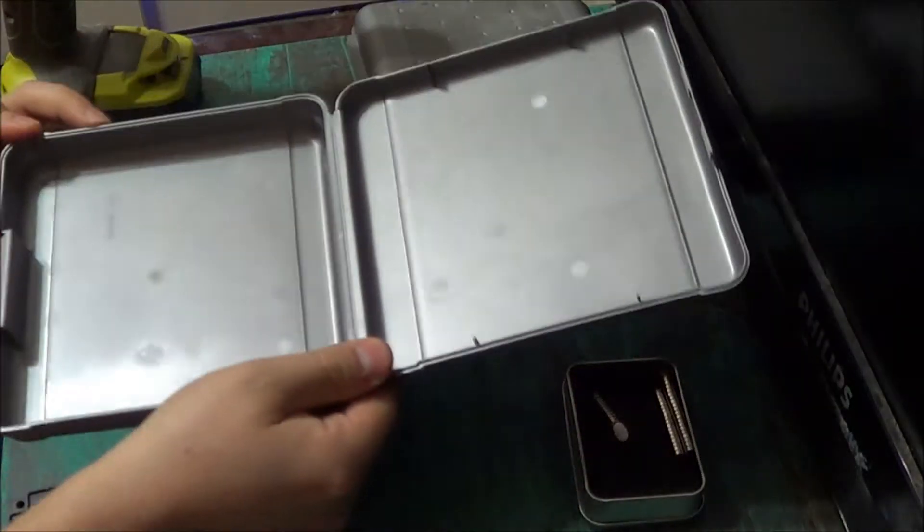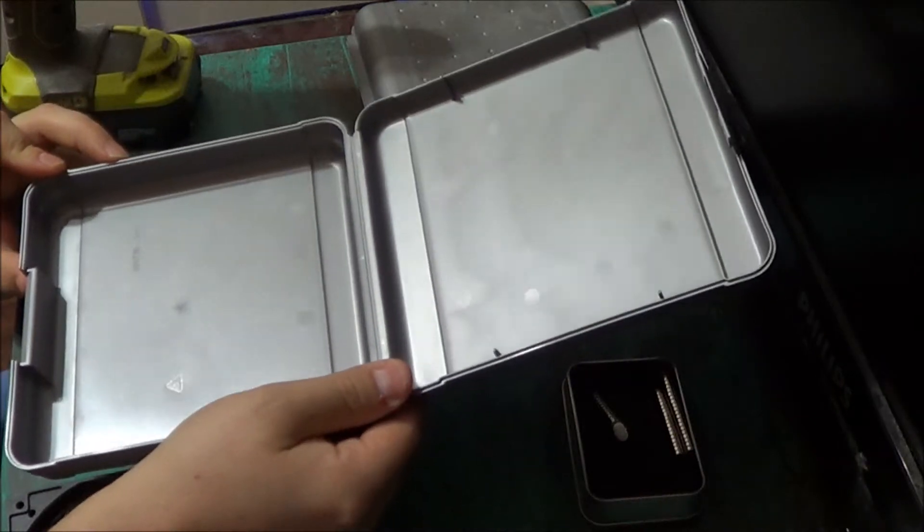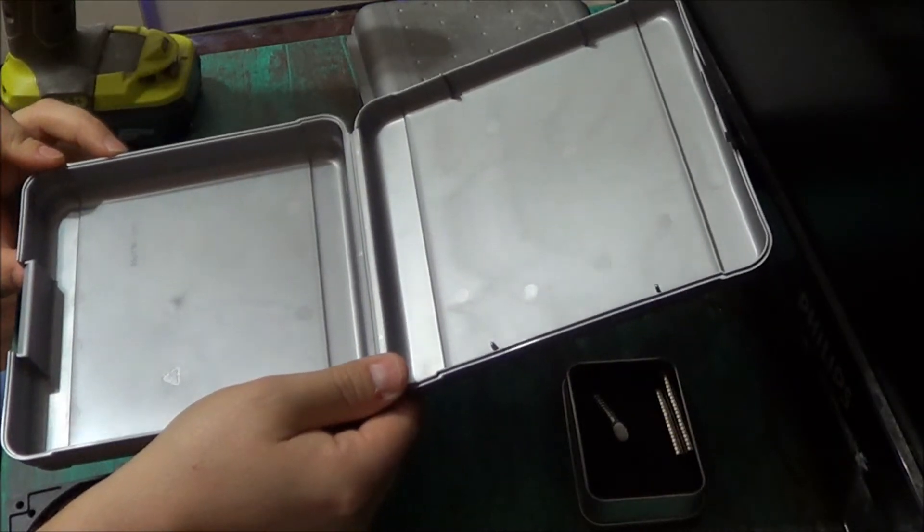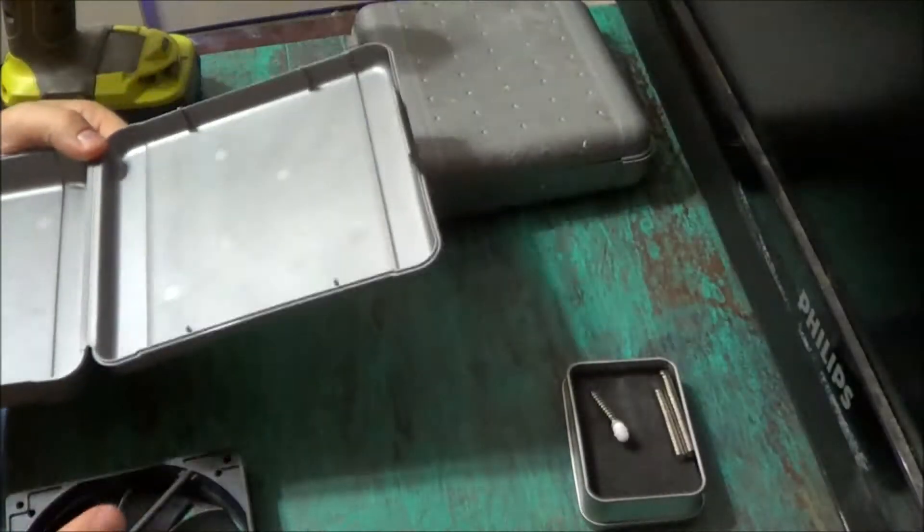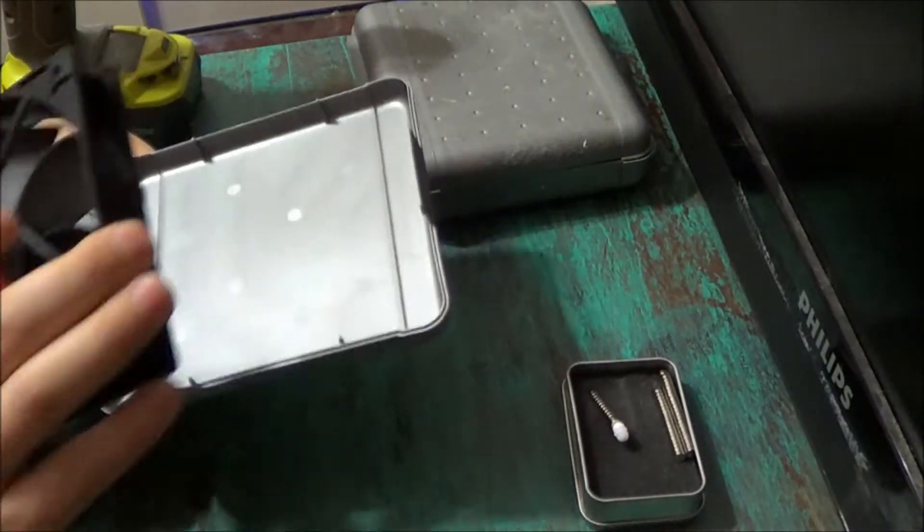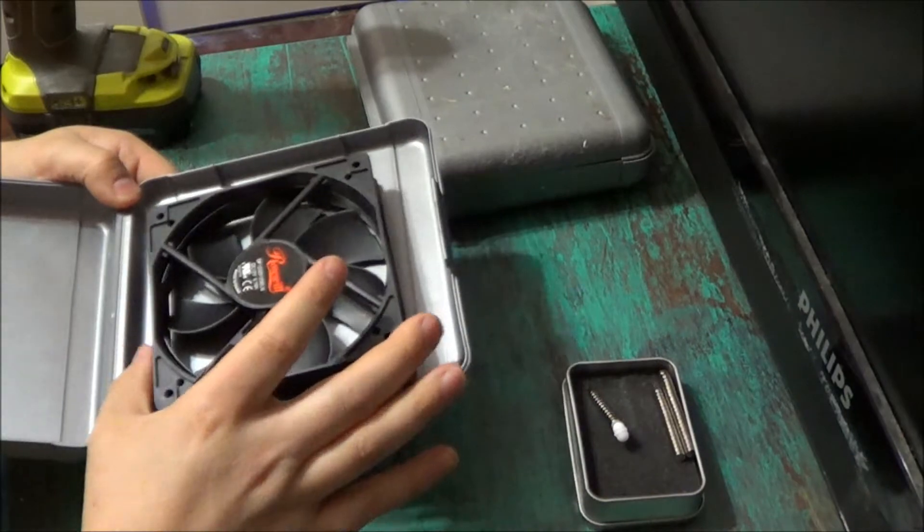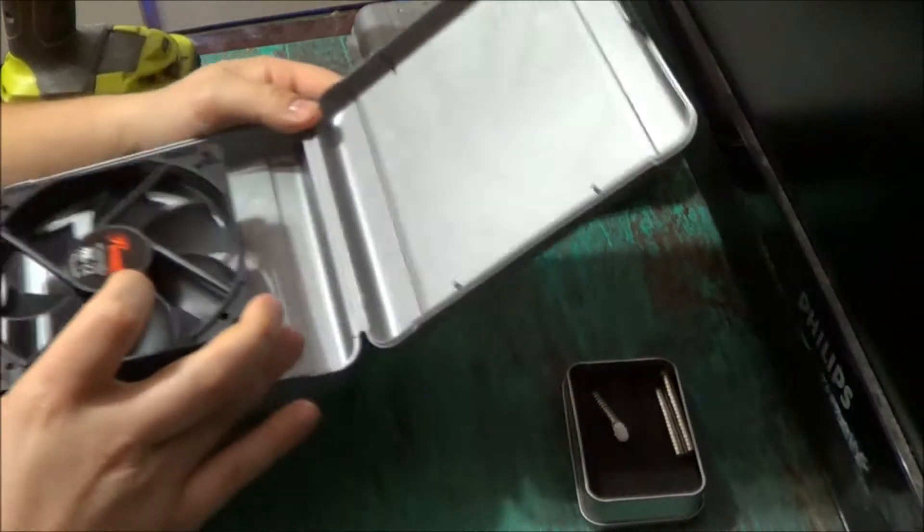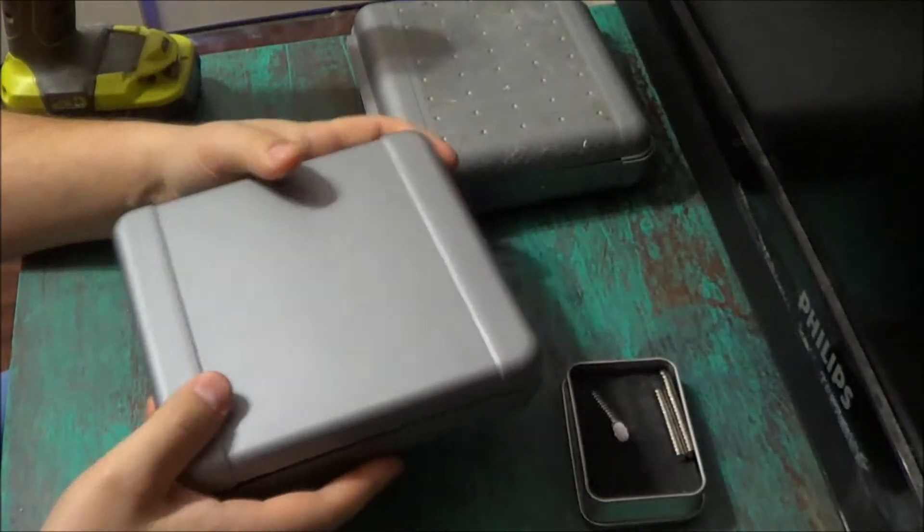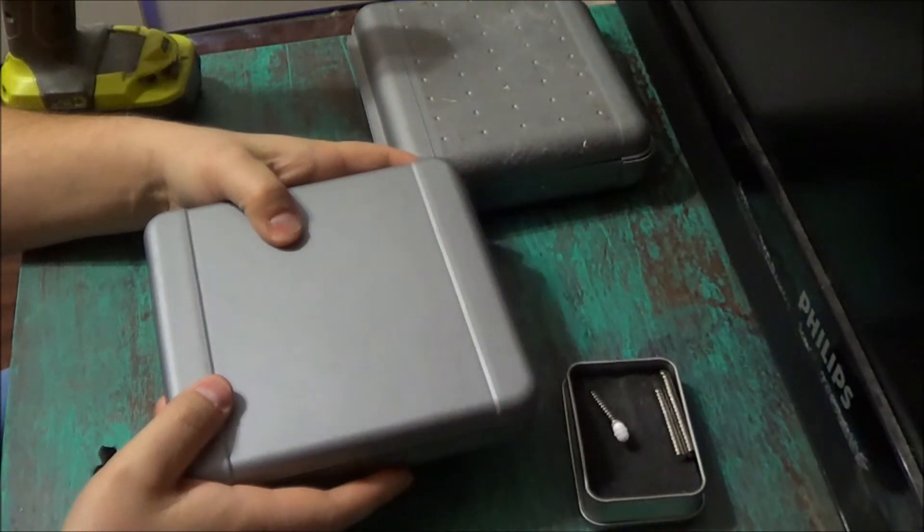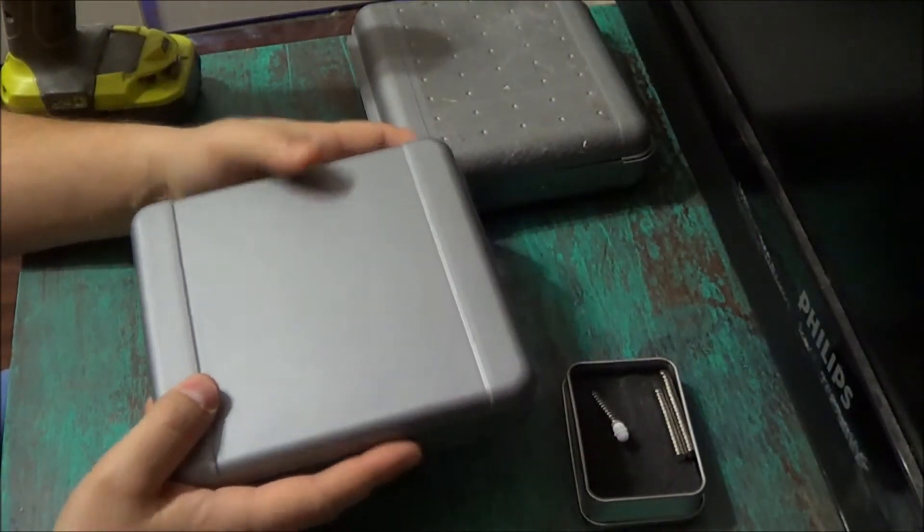First of all, I want to open my box and I want to make sure that my fan is going to fit in. Perfect.